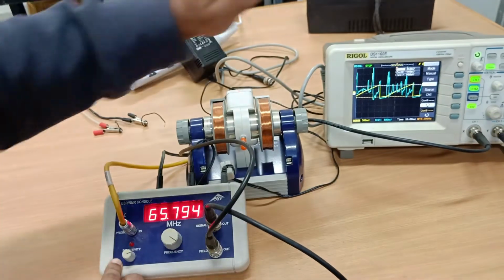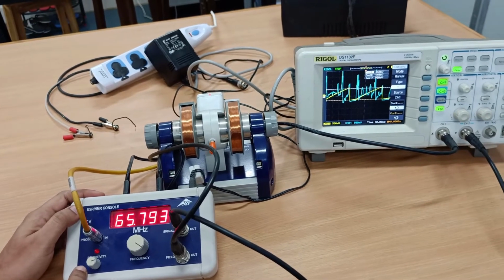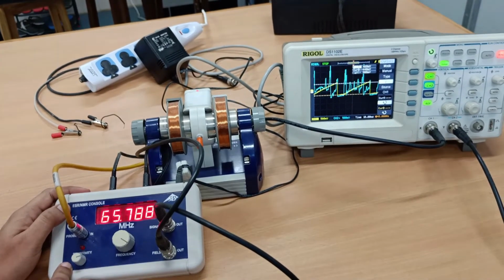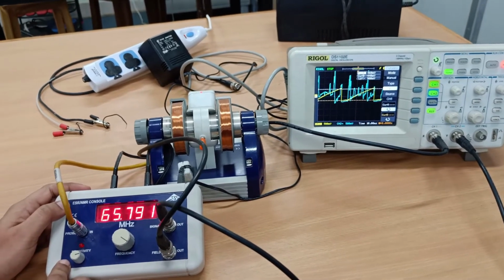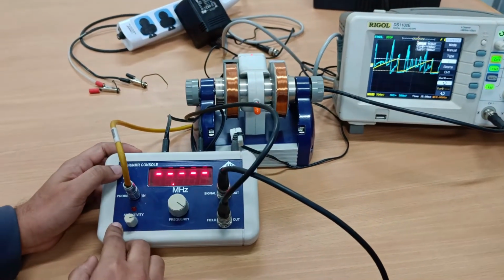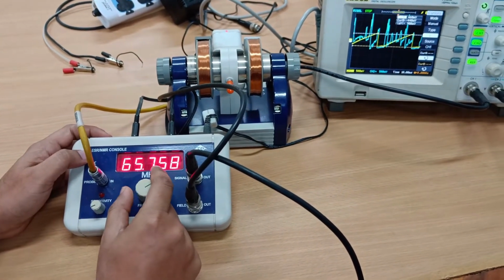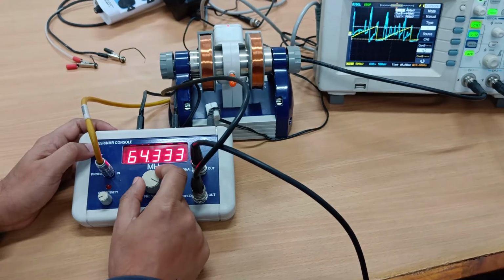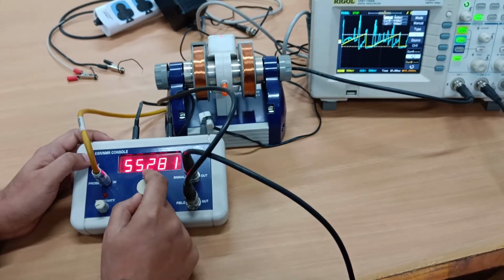So this is the procedure for the ESR experiment. Any questions? I hope you have already seen the video and the theoretical part, where the functioning and how it works is described.